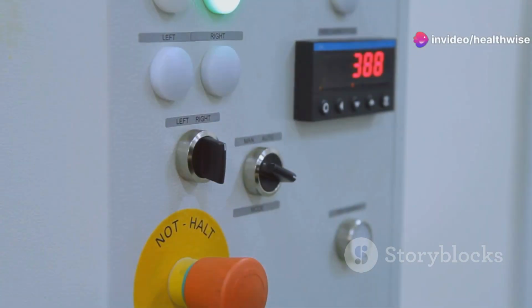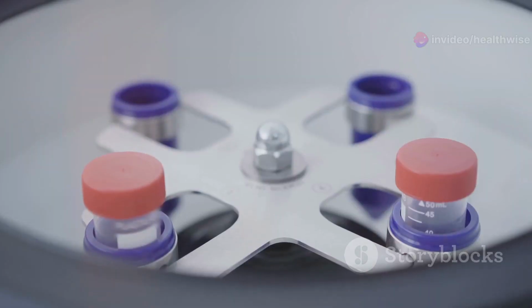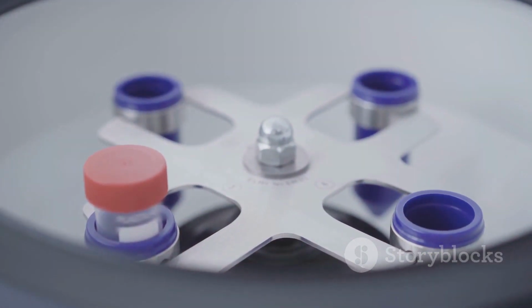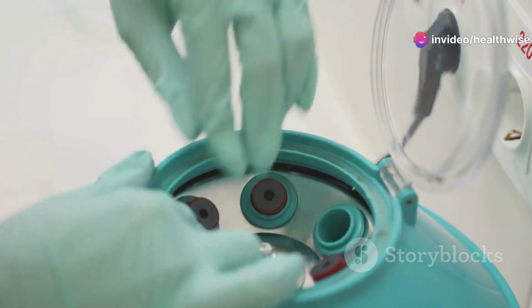3. Set the spin cycle. Most centrifuges have a control panel where you can set the speed and time for your spin cycle. Consult your lab protocol or experiment instructions for the appropriate settings. 4. Start the spin. Once everything is set, press the start button and let the centrifuge do its thing.